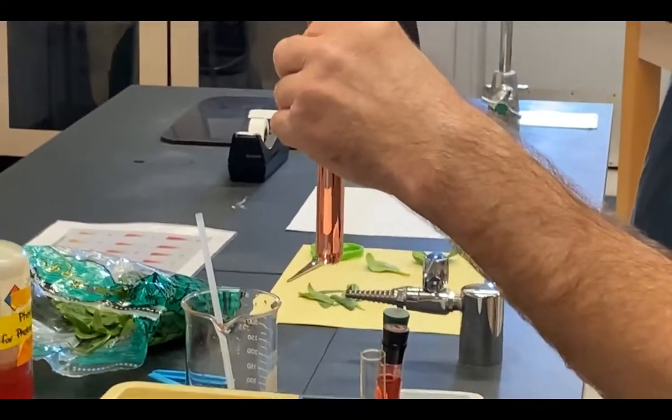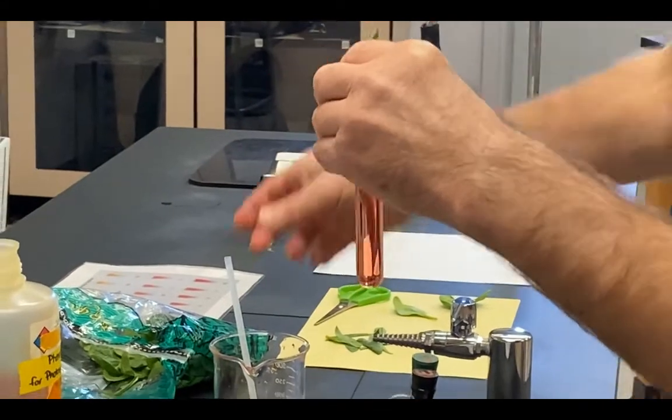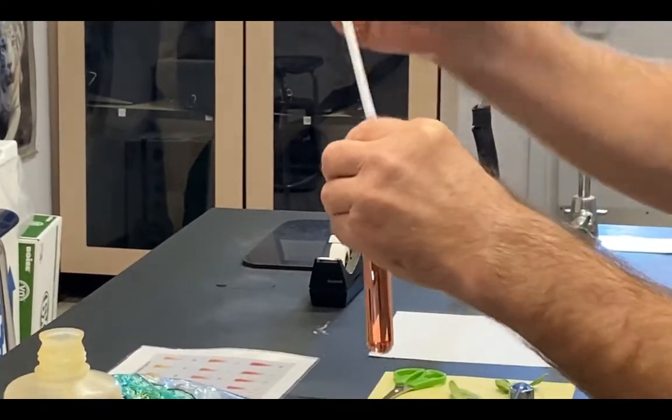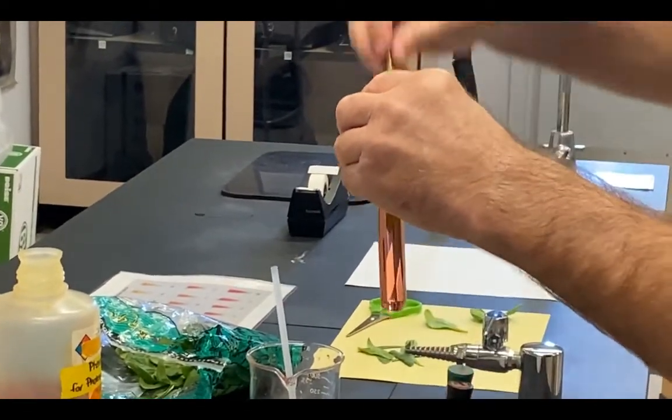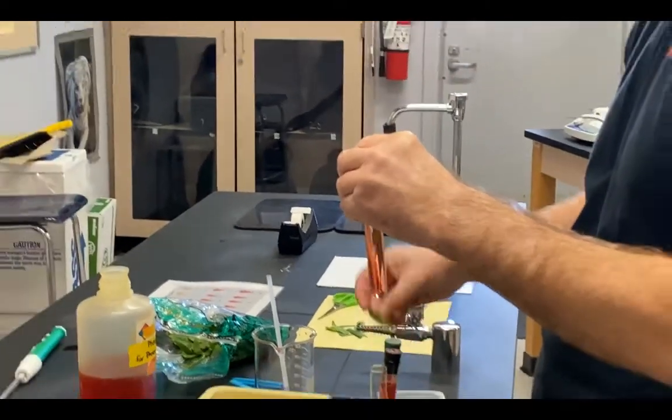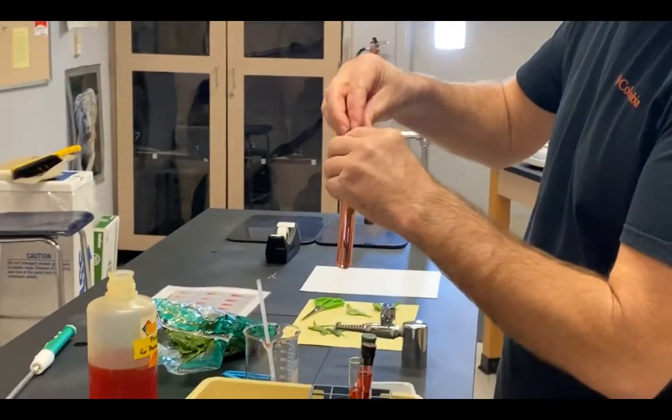It's a fun thing about adding spinach to a tube. It doesn't necessarily want to go in there. But I can use my straw to push it in. I want as much leaf surface area exposed to the sun as possible.